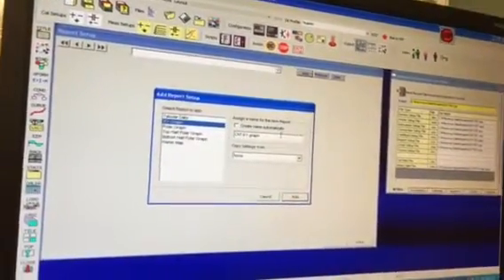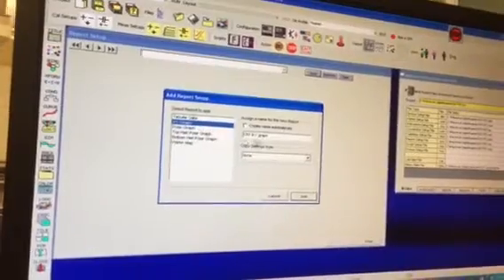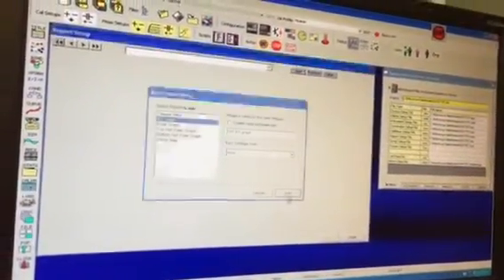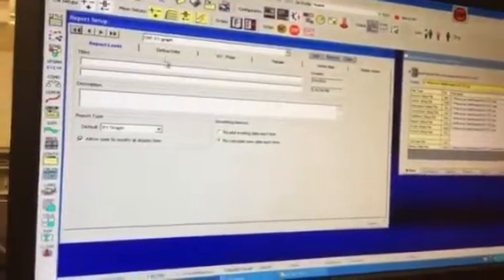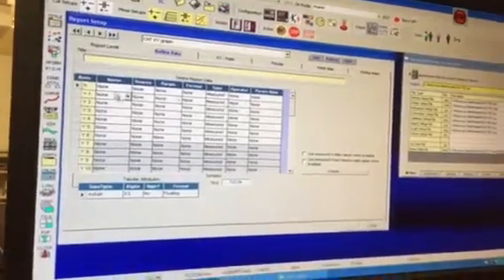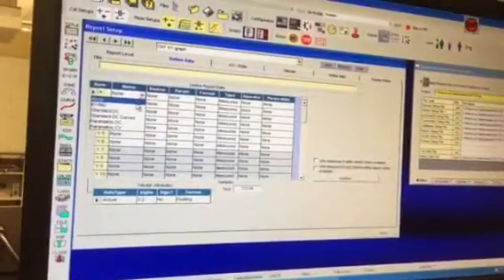Okay, so now we are looking at an XY graph. Yep. Graph and data. And there's your name. There's your ID.